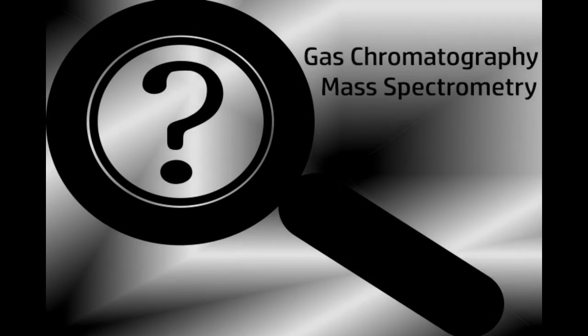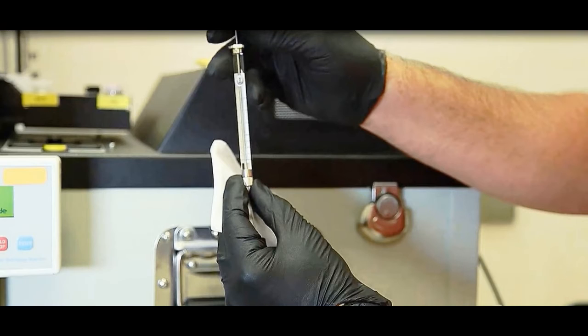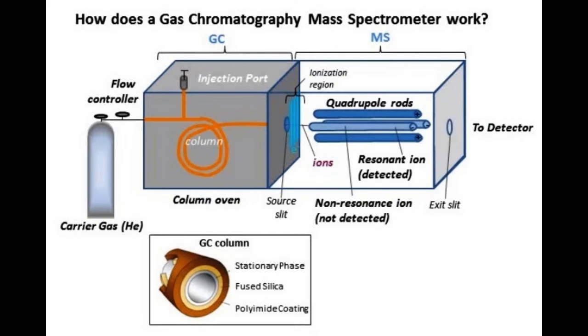Analysis begins with the gas chromatograph to separate a sample into its individual chemical components. A chemist gathers available samples, and then a sample of the analyte is introduced by syringe injection into the heated injector tube, where it is vaporized and mixed with the carrier gas. The sample is effectively vaporized into the gas phase and separated into its various components using a capillary column coated with a stationary phase. The compounds are propelled by an inert carrier gas such as helium, hydrogen, or nitrogen.